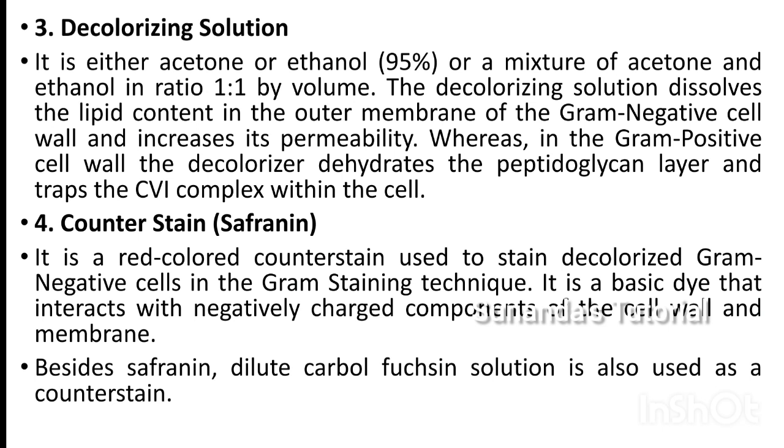Okay, but in the gram positive cell wall, the decolorizer dehydrates the peptidoglycan layer and traps the CVI complex within the cell. So the decolorizer cannot wash out the peptidoglycan layer of gram positive bacteria.